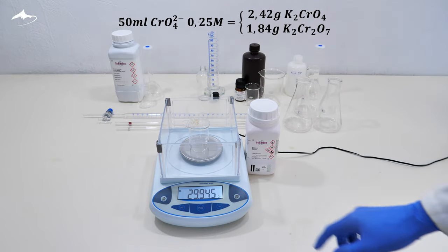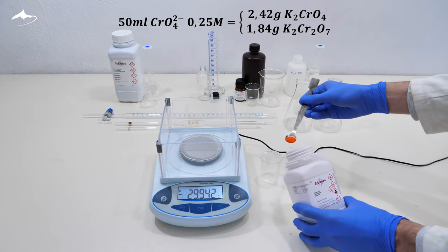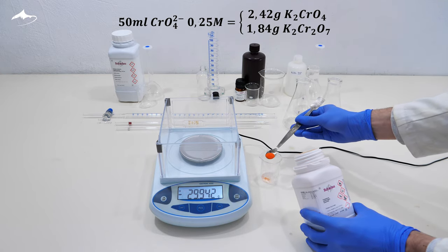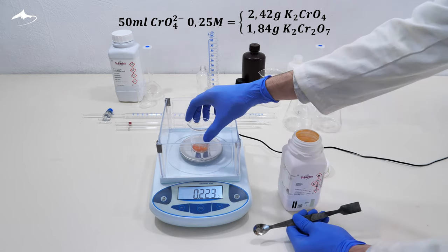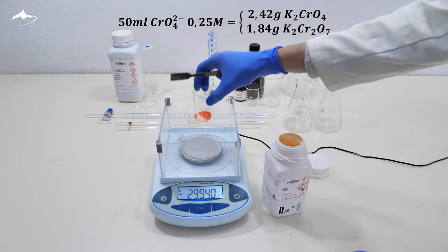To prepare 50 milliliters of chromate ion 0.25 molar solution, approximately 1.84 grams of potassium dichromate needs to be weighed. I don't have a chromate salt, but dichromate can also be used instead, with a little modification you will see later.